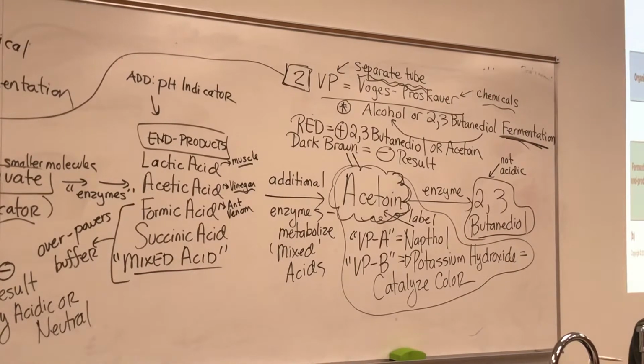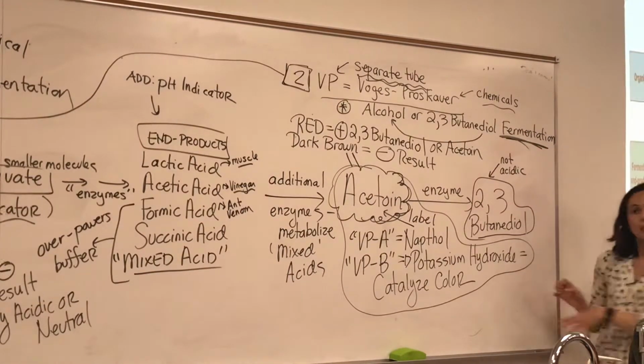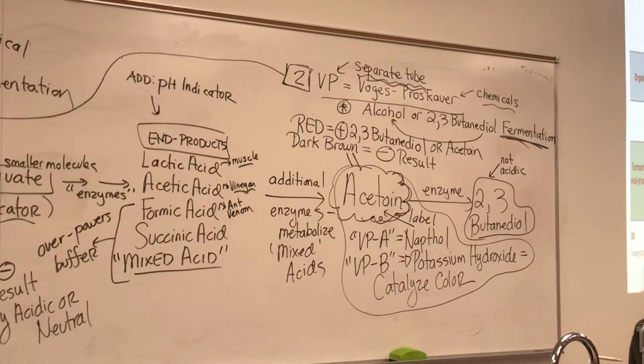You'll have other things to help you out too, like if you know it's gram-negative and the shape and all these other things. It's an additional tool that'll help you narrow down for sure. Is there any way that we would get a negative result in one and a positive result in the other? Oh yes, definitely.